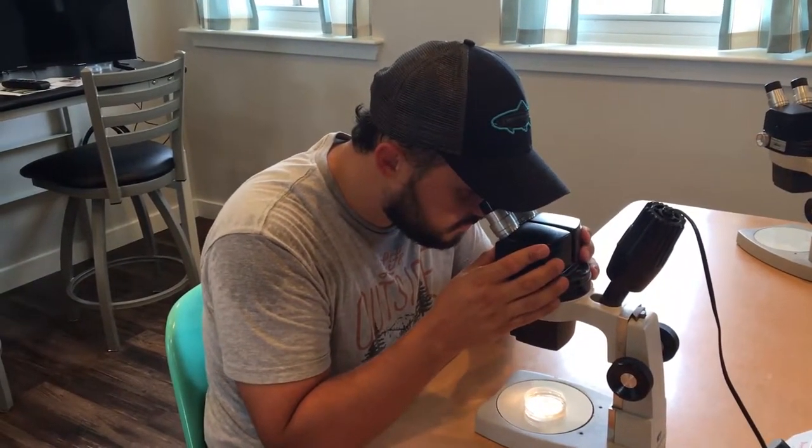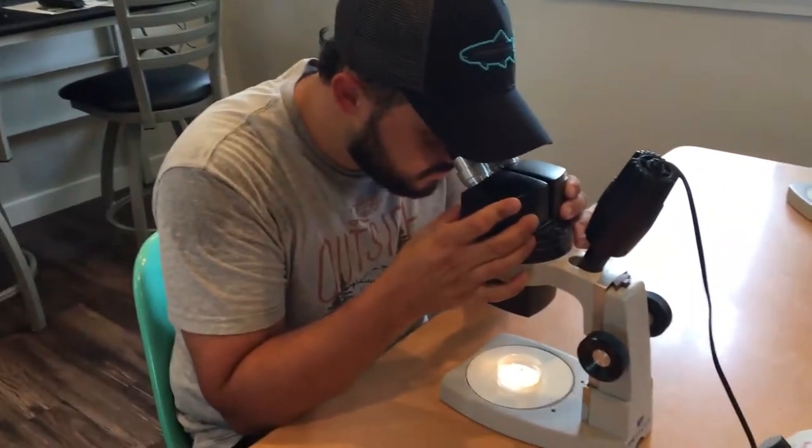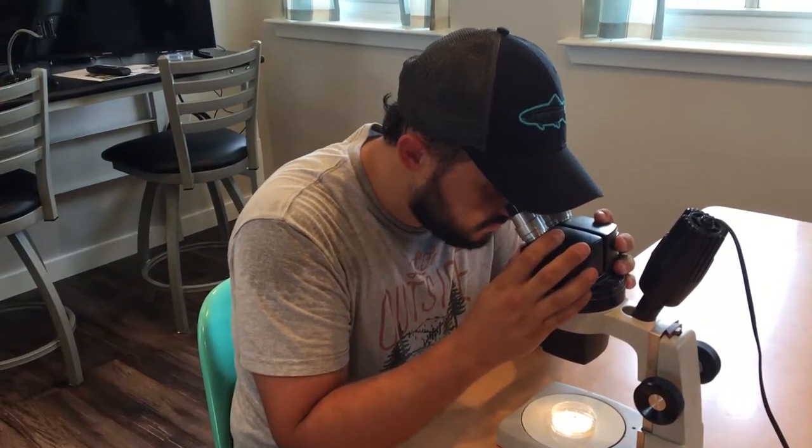The eyepieces on this microscope are movable so that by grabbing the ocular base, you can slide them back and forth until they fit your eyes comfortably. When you see a single image through the eyepiece with both eyes open, you're good.